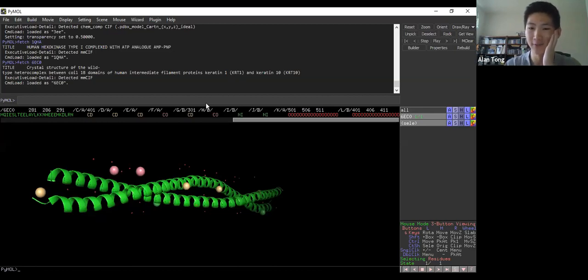Does X-ray crystallography also determine the presence of alpha helices and beta sheets? No. So X-ray crystallography gives you the positions of the electrons, the electron contours. But then we have our model where we put the atoms inside. And some other program can then analyze, well, does this look like an alpha helix, or does it look like a beta sheet? And then it can also make those into cartoons.